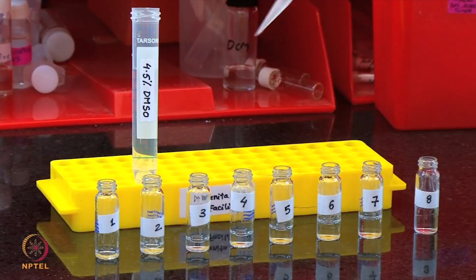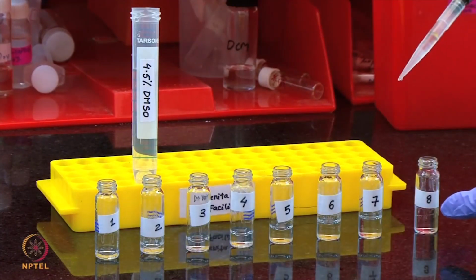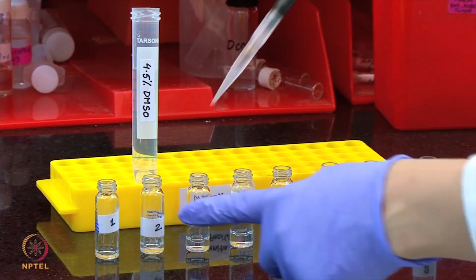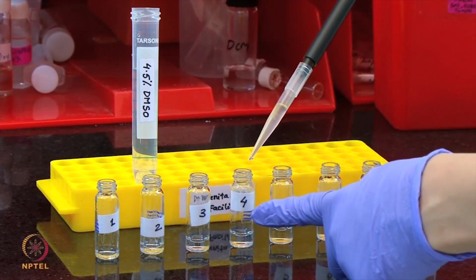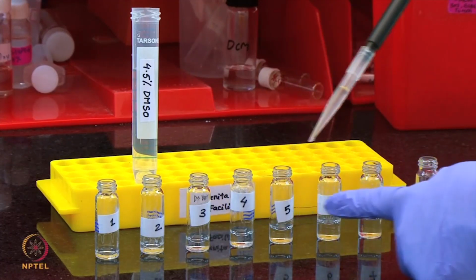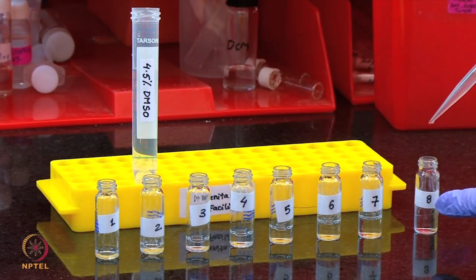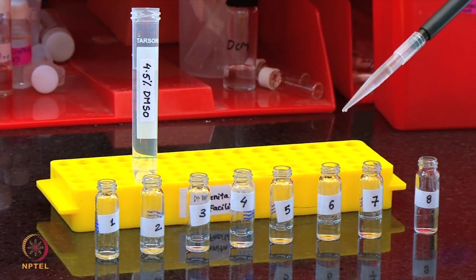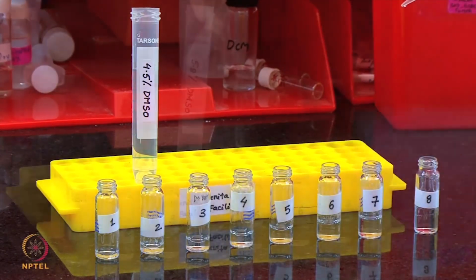Thus, we will number these tubes as 1 to 8 and add 200, 400, 600, 800, 1000, 1200 and 1400 microliter of 4.5% DMSO in tubes 2 to 8 respectively.